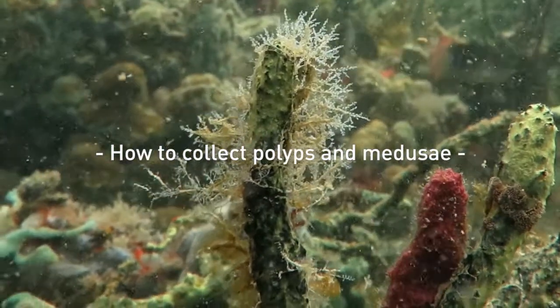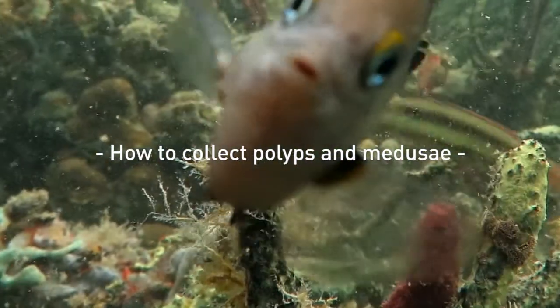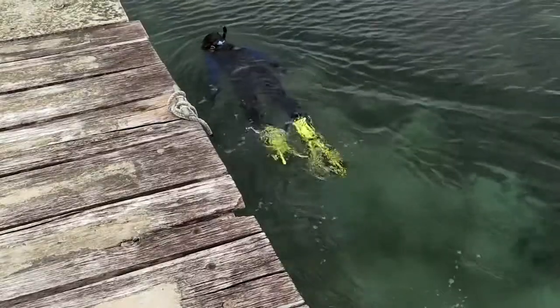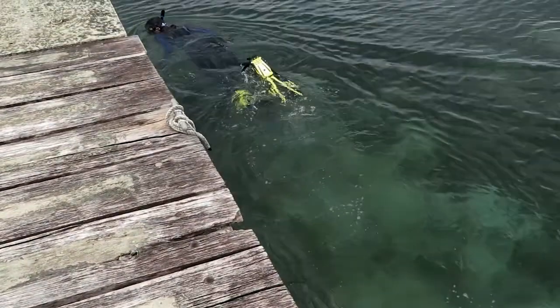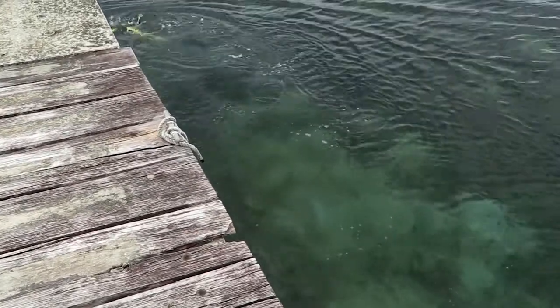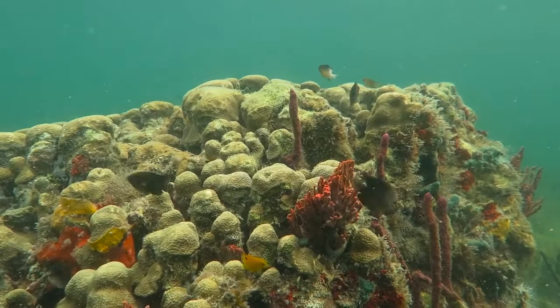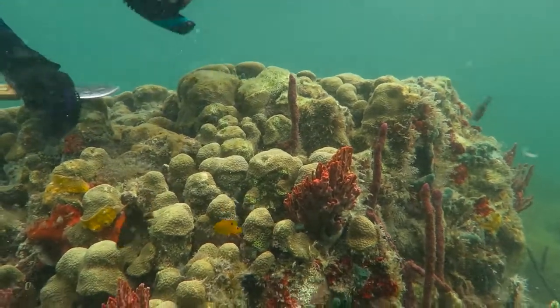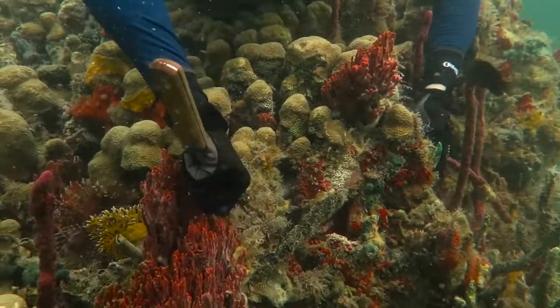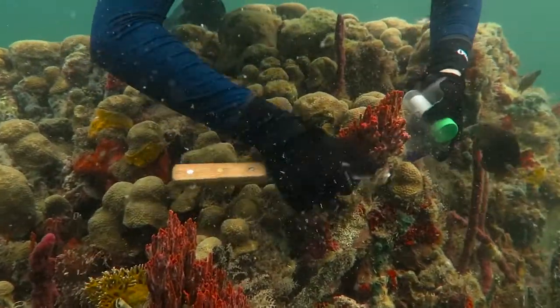In this video we are going to learn how to collect polyps and medusa of the cnidarian class Hydrozoa. Hydroids are very abundant in shallow waters and you can collect them by snorkeling or diving. They live on a variety of substrates such as rocks, algae, but also on animals such as crabs, hermit crabs, sponges, and even fishes.